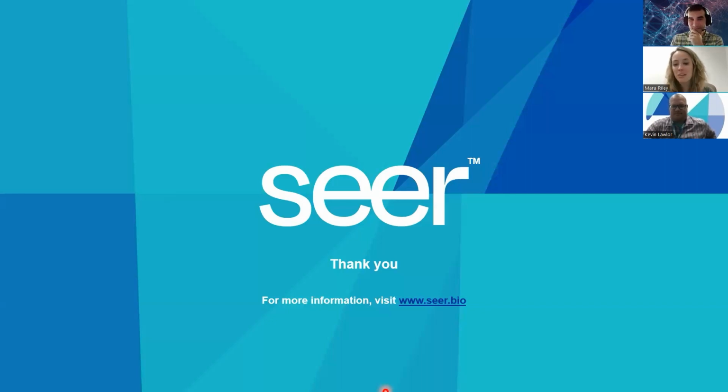But if you're saying something like seawater or environmental samples that we haven't really researched a bunch, we'd be more than happy to work with you to set up an experimental design and see what we can do for you. Okay, that'd be really cool. I know there's some researchers doing different environmental work, or even microbiomic research, taking fecal pellets, solubilizing them, and doing something like that would be pretty cool.